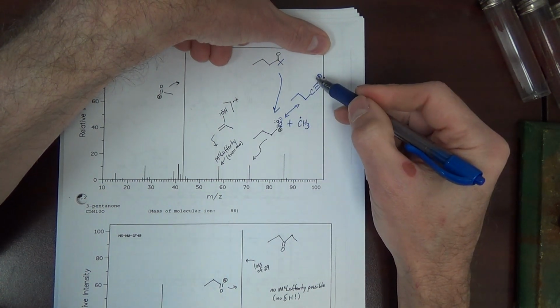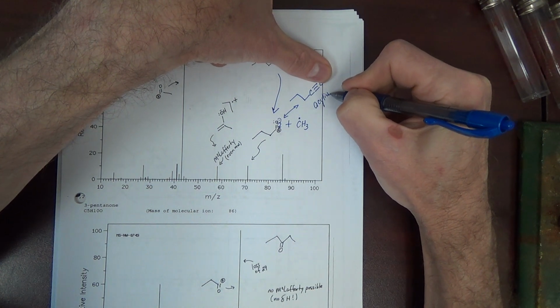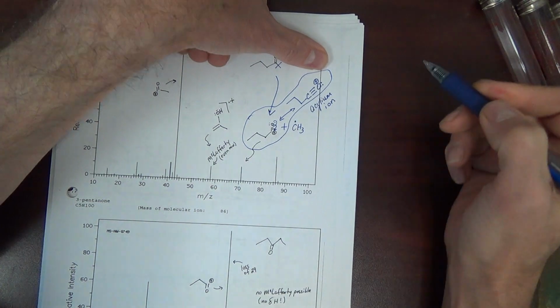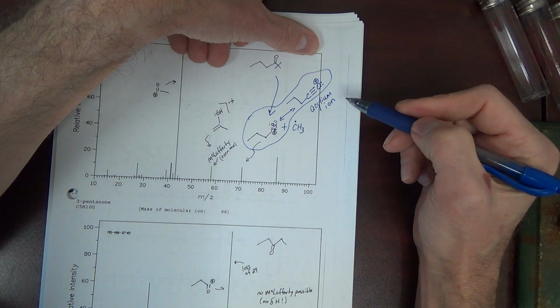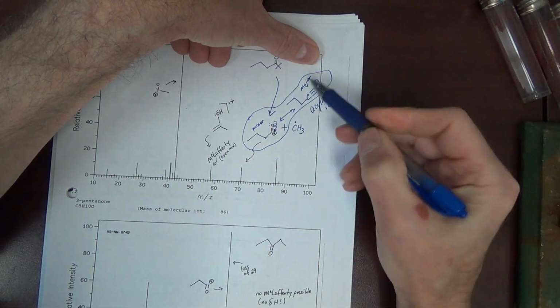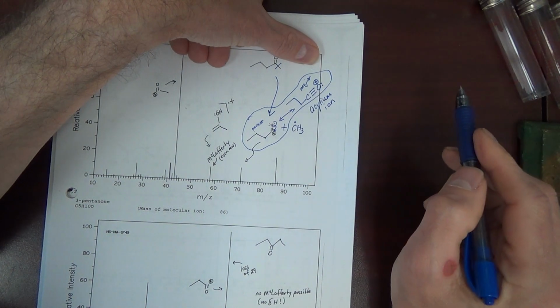This ion here, remember the true structure is a hybrid, this is one ion. This is called an acylium ion, A-C-Y-L-I-U-M. All right. There's your acylium ion. You might draw the hybrid, which is major. This is major. This is the minor resonance structure. The hybrid's going to look more like this because there are more bonds. More of the positive charge here is on oxygen, really.